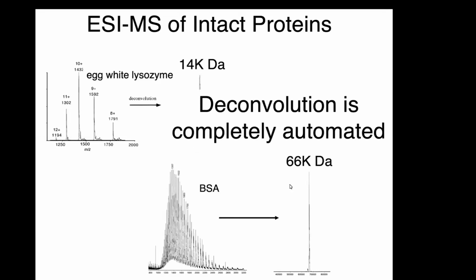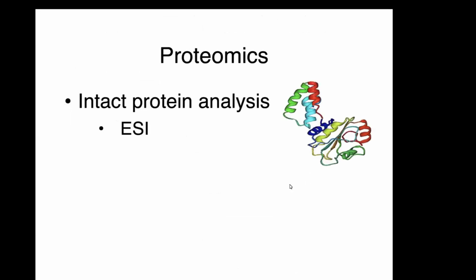The last thing I'll note here is if you look at the x-axis of these, you'll see that the M/Z range is about 2,000 to 3,000 daltons max. If we did not see multiple charging of the protein, we would not be able to observe these in this small scan range. The other approach that we take for ionization of proteins is MALDI.